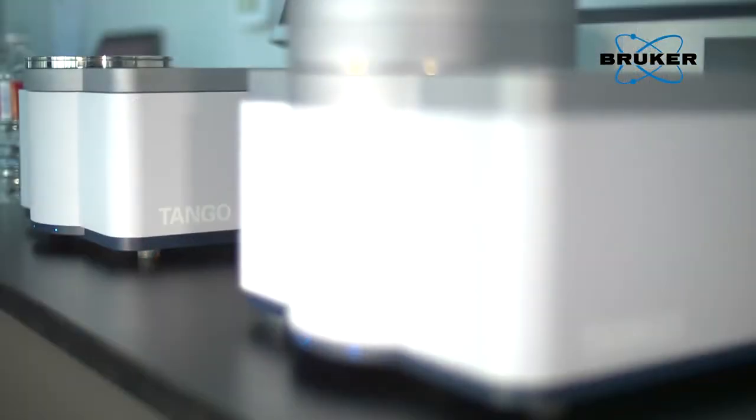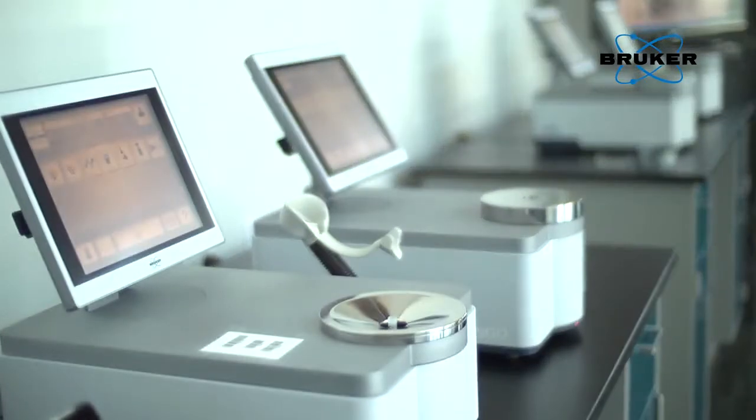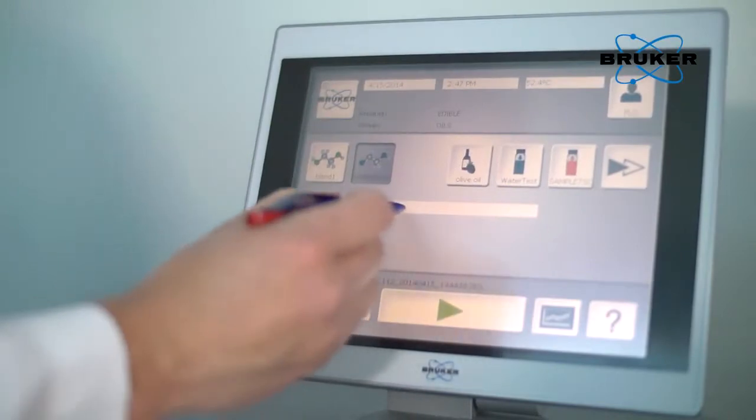Faster, simpler, more secure. With Tango, your NIR analysis speeds up. Tango has exactly what users require of an FT-NIR spectrometer suitable for industrial use: robustness, high precision, and straightforward operator guidance.